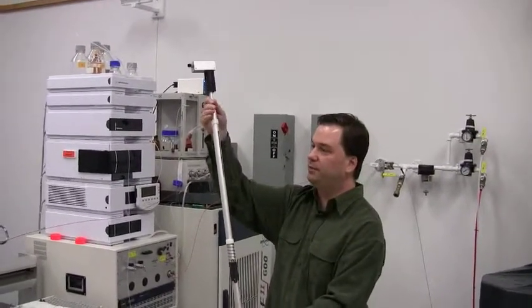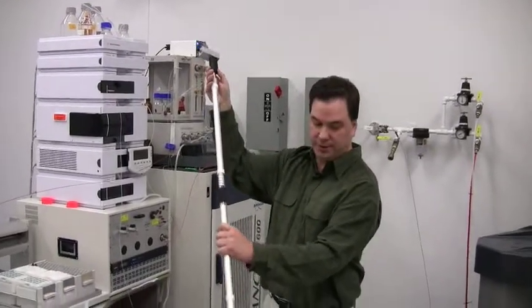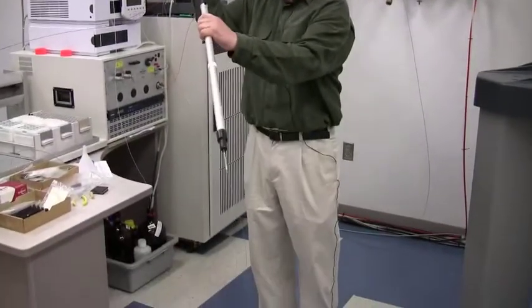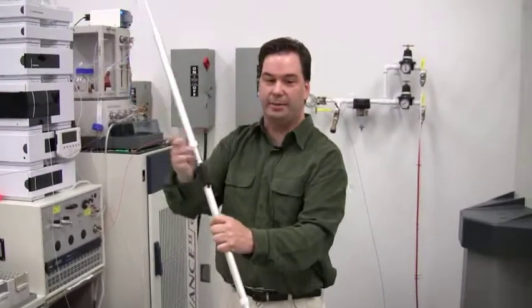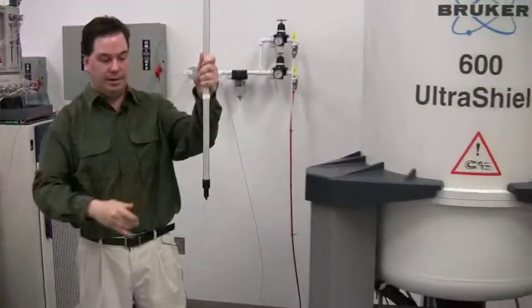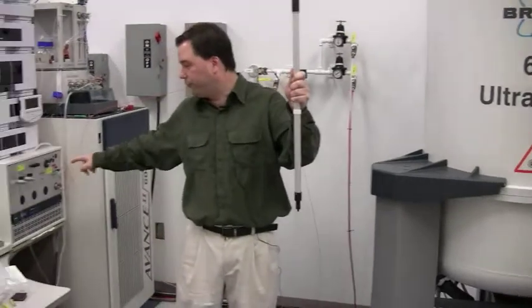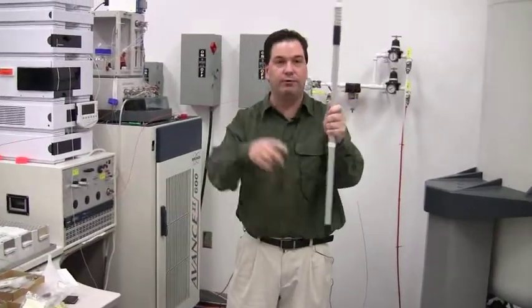As you can see, this accessory contains a flow cell in it. We put this accessory in the top of the magnet, and then we are able to flow directly from the HPLC right to the NMR.